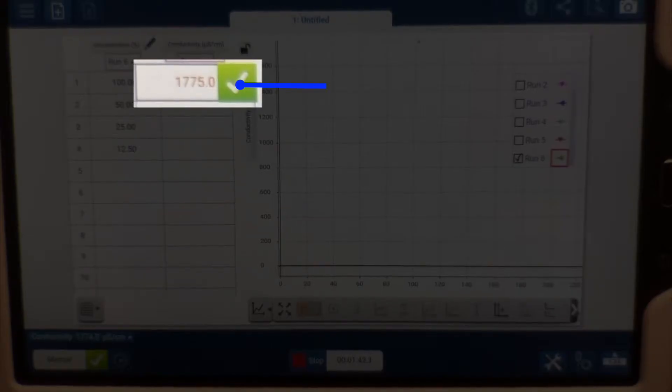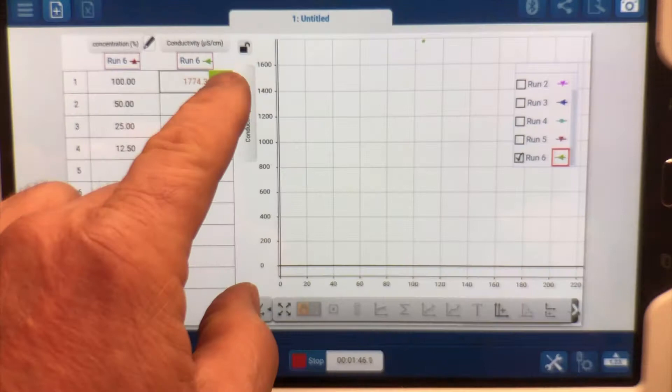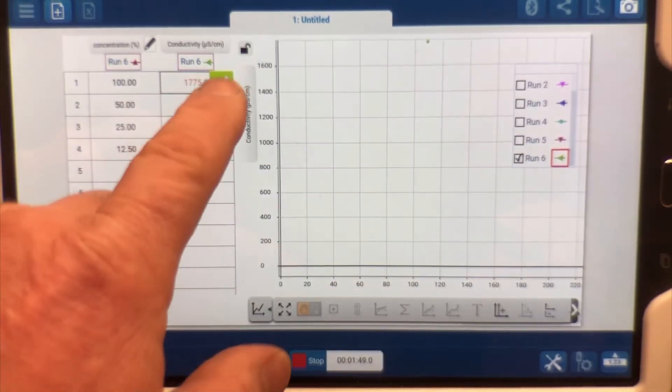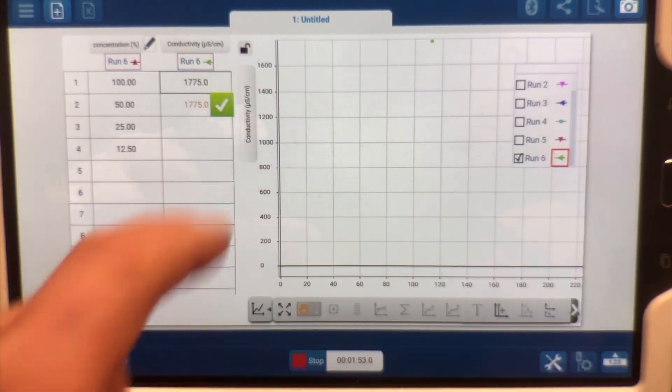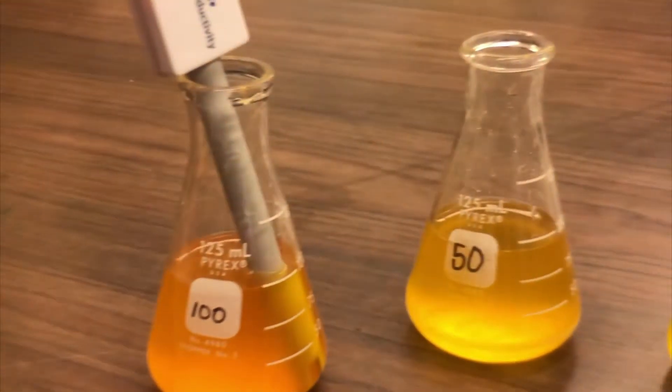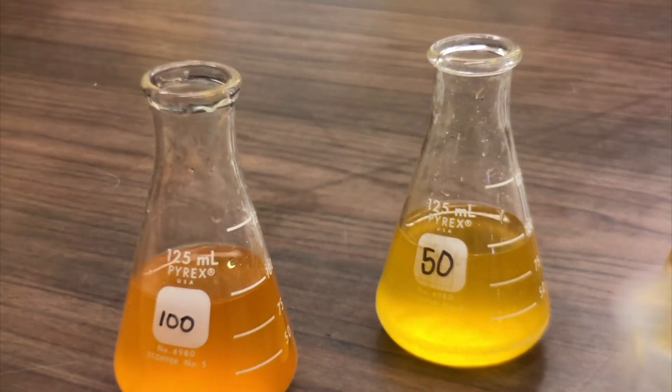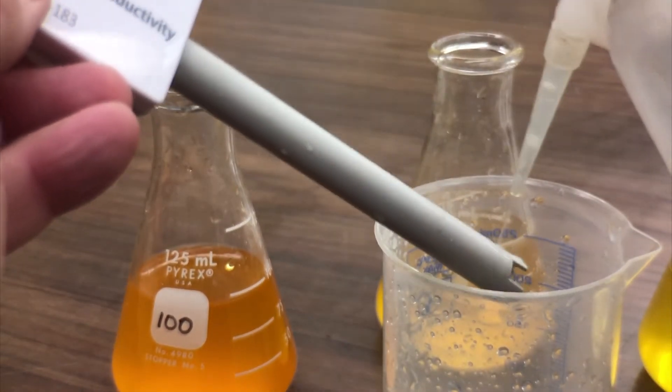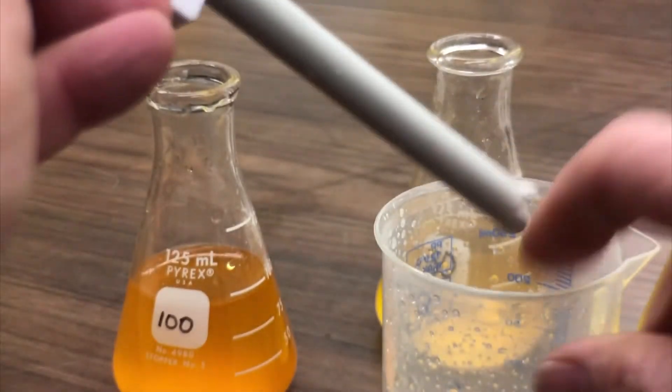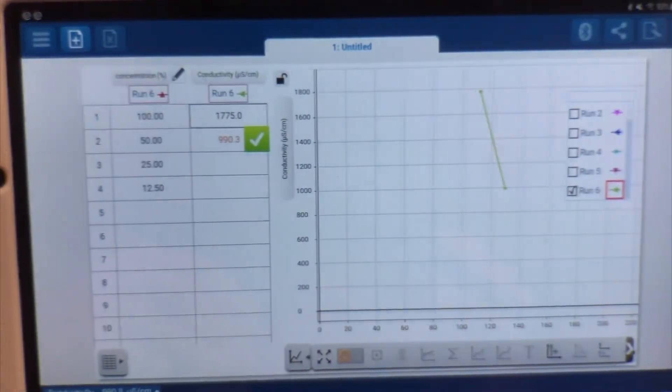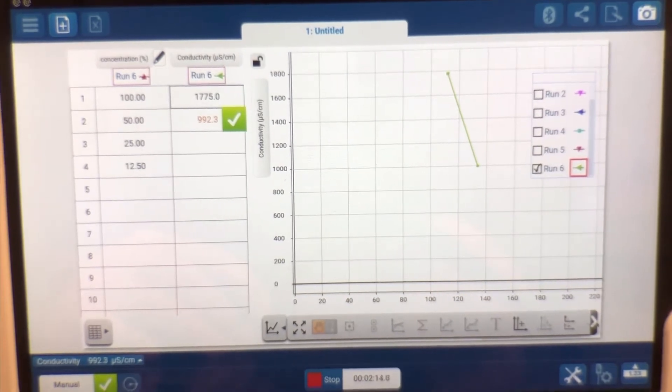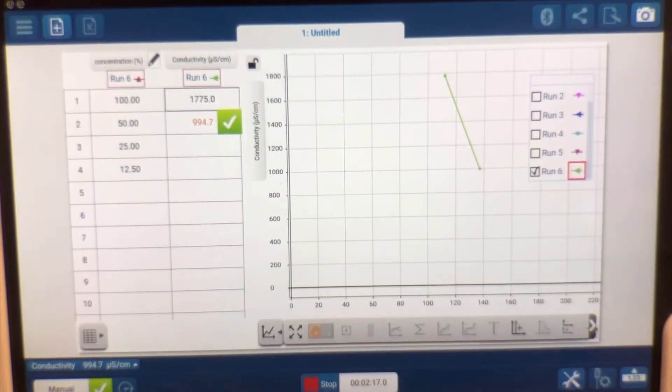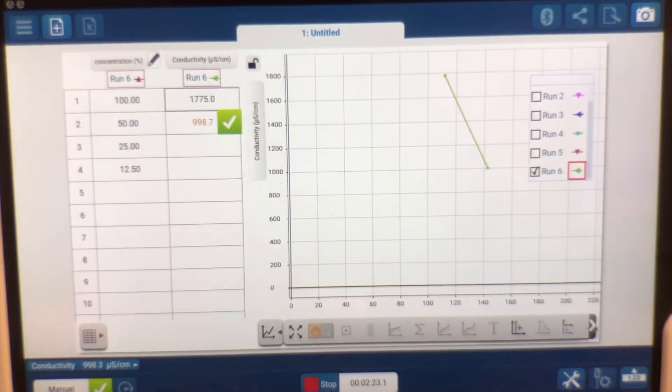So we're going to click on this green check mark and when it moves to the next. Now what we're going to do next is move our probe and again we have to make sure it's clean and then we put it in the 50%. Now when we go back over here we should see and we do a difference in it because it dropped 50% of its concentration. Now it's at 997 and we're going to let that run for a little bit.